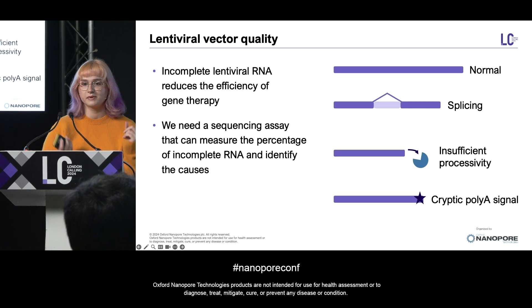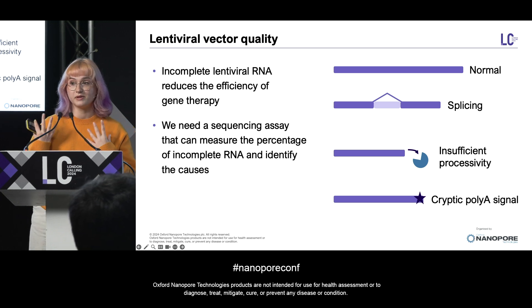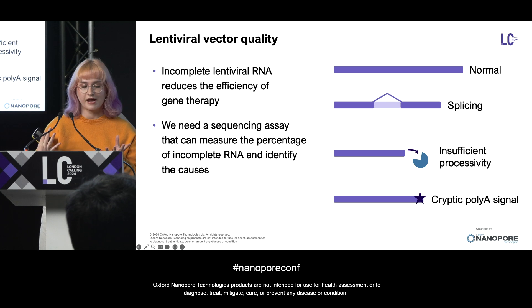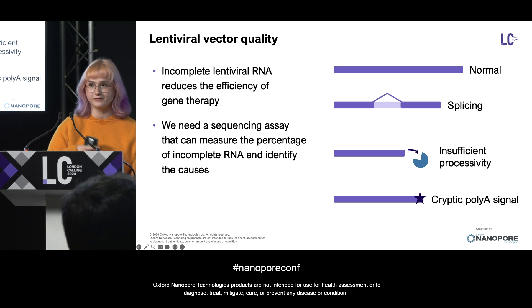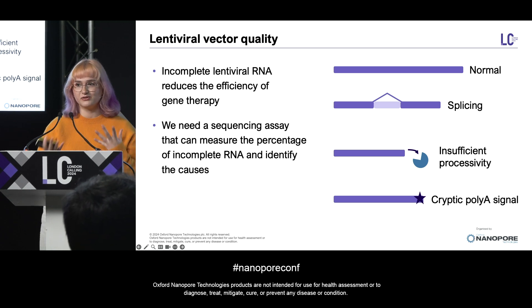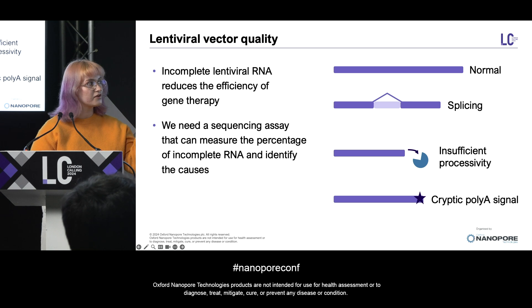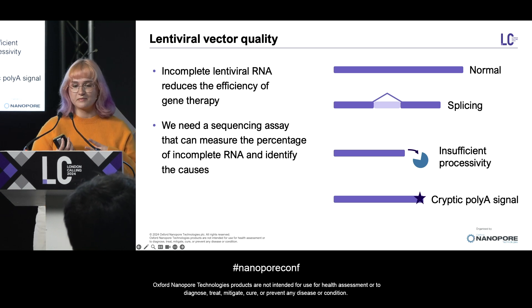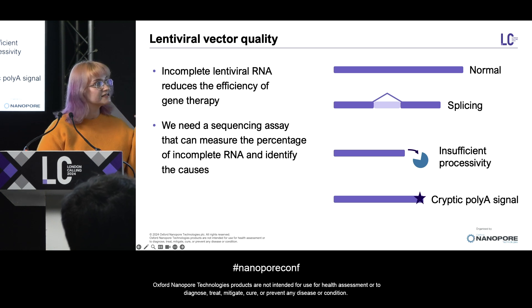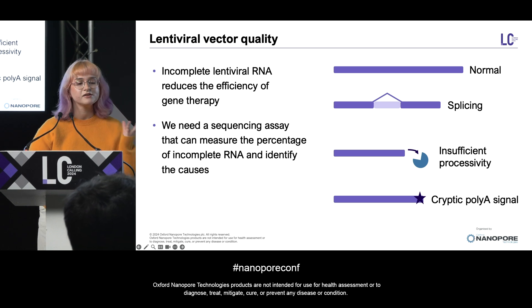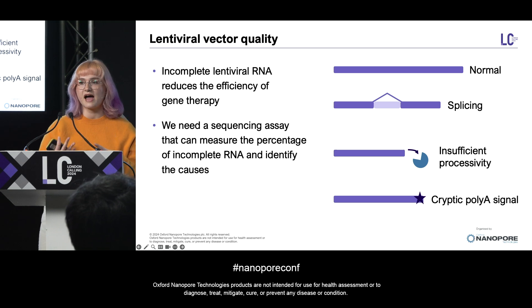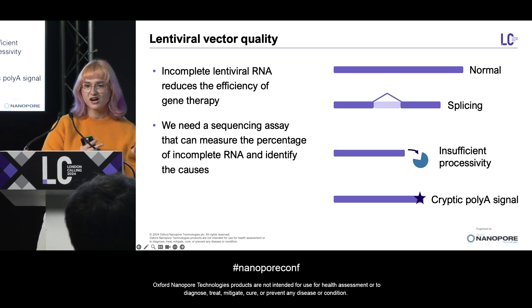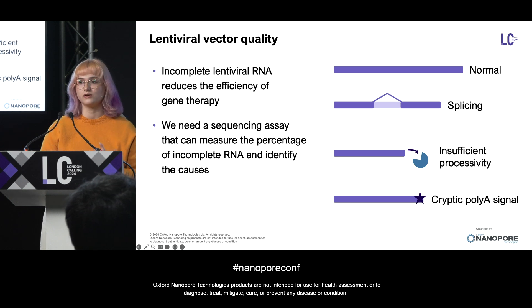One of the common problems in lentiviral gene therapy production is incomplete vector RNA. This definitely reduces the efficacy of the gene therapy because if you're missing important parts like part of the transgene or the promoter, that's not going to have a therapeutic effect for the patient. There are a number of different potential causes identified in the literature, including splicing, insufficient processivity of the RNA polymerase, and usage of cryptic poly A signals. Because there are so many different potential causes, it's really important that we have an assay that can not only measure how much RNA is incomplete but also tell us why, so that we can go on to address these things.